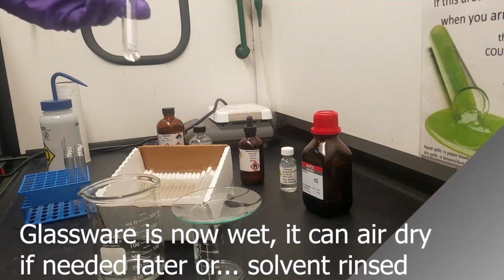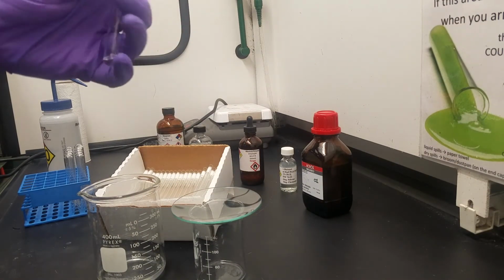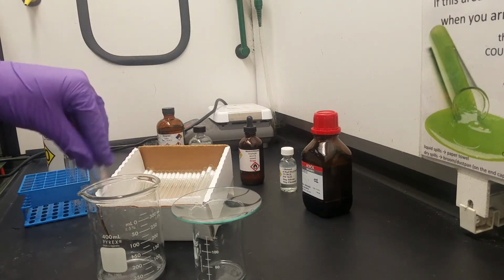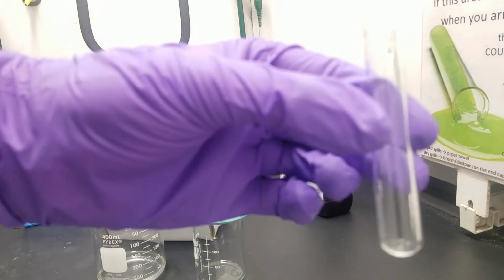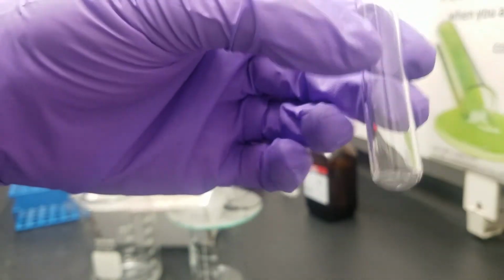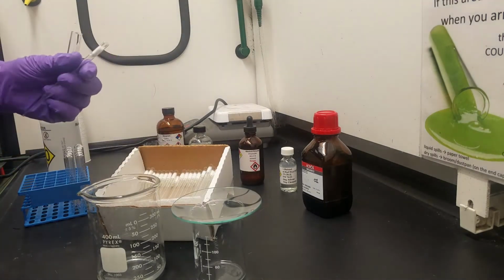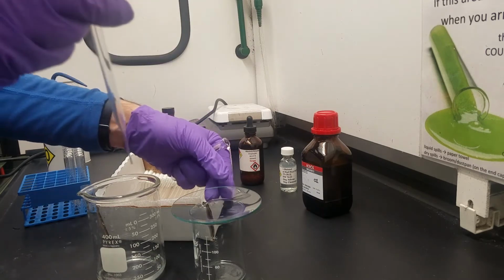If you need the glassware right away and it needs to be dry, a very common method to kind of remove the remnants of water is to use a secondary organic solvent to remove it. Acetone is a great option. In this case, I didn't have any acetone, so what I went through and did is used a little bit of ethanol first, which removed the vast majority of the water. The added bonus for our ethanol is that its boiling point is a little bit lower than that of water, so it should evaporate and, quote unquote, dry quicker.